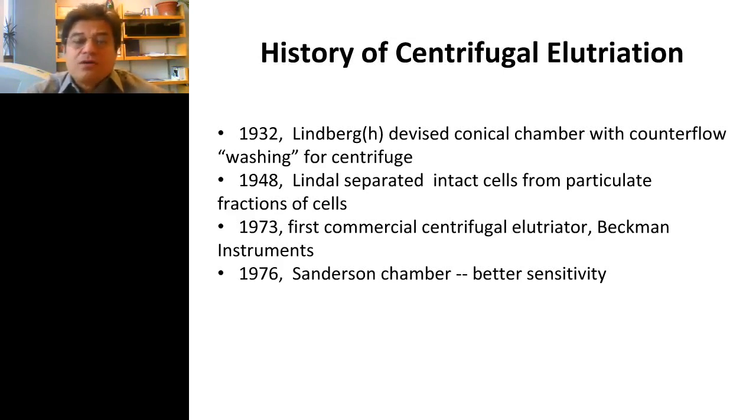So this technology has been around at least in its theoretical applications since the beginning of the 1900s, and I illustrate the Lindbergh here with the H at the end of the name in parentheses. This is kind of a funny little story because there are a couple of references that point to Lindbergh with a G and not the H from a 1932 reference. And in finding this reference, it turns out that this is in fact Charles Lindbergh, the pilot who in 1927 flew from New York City to Paris.